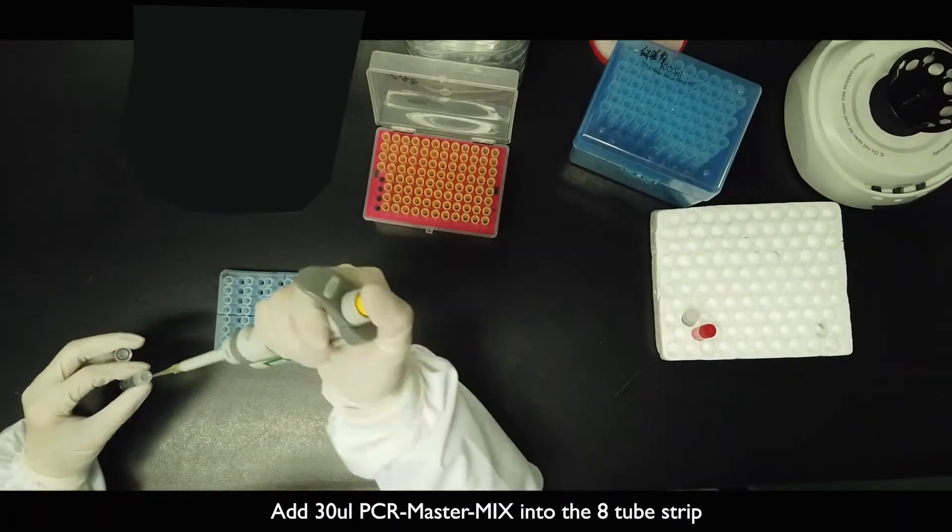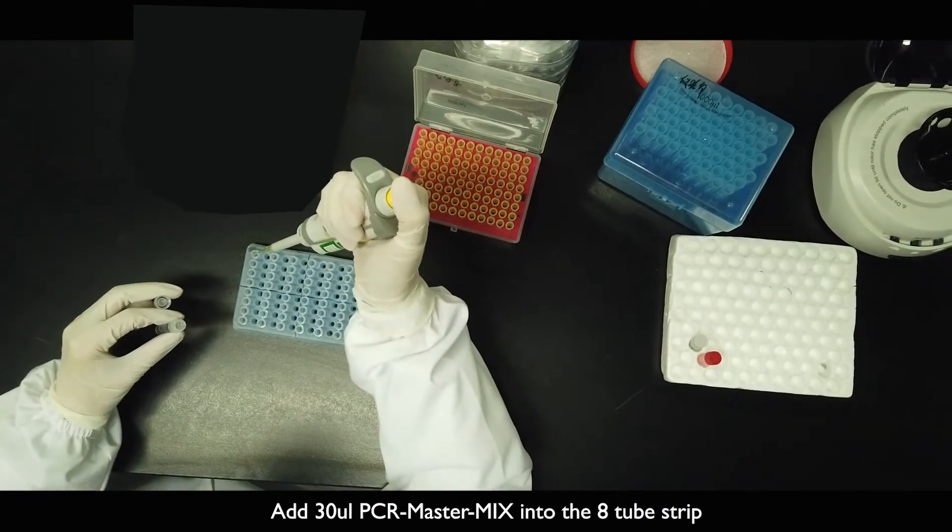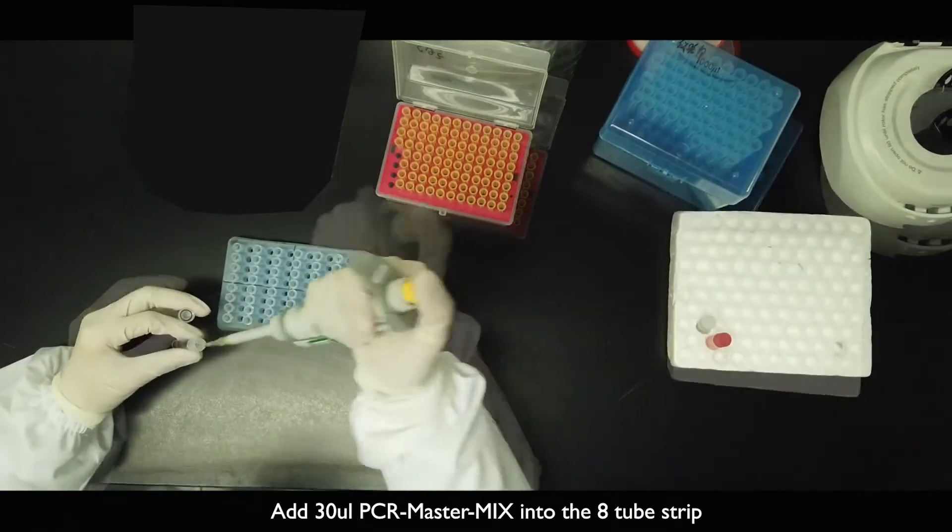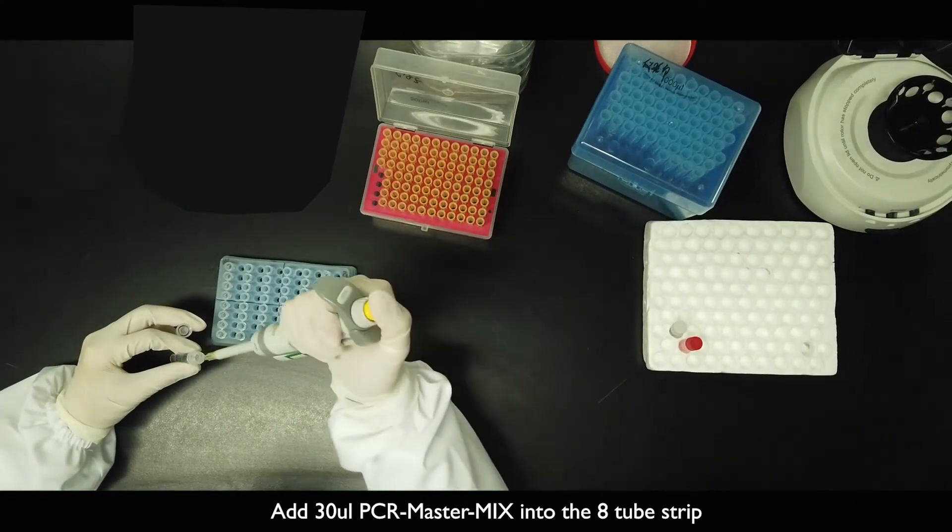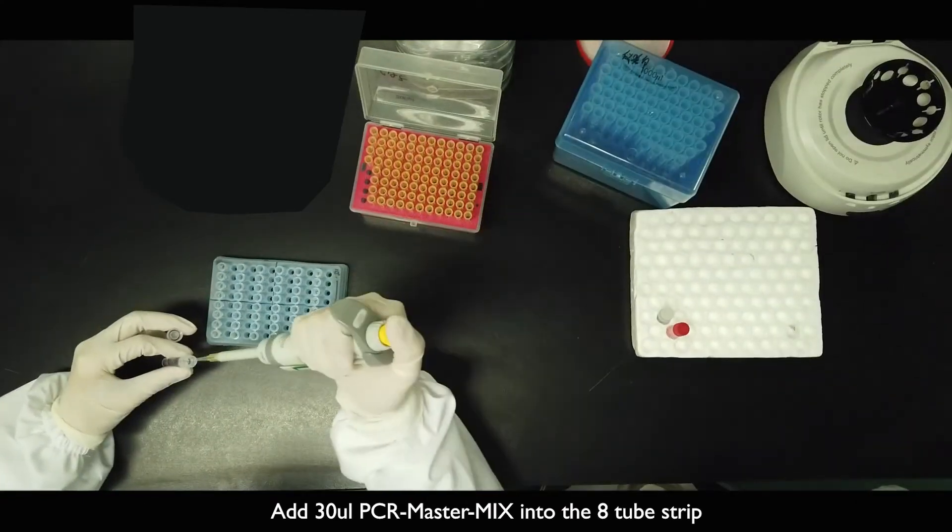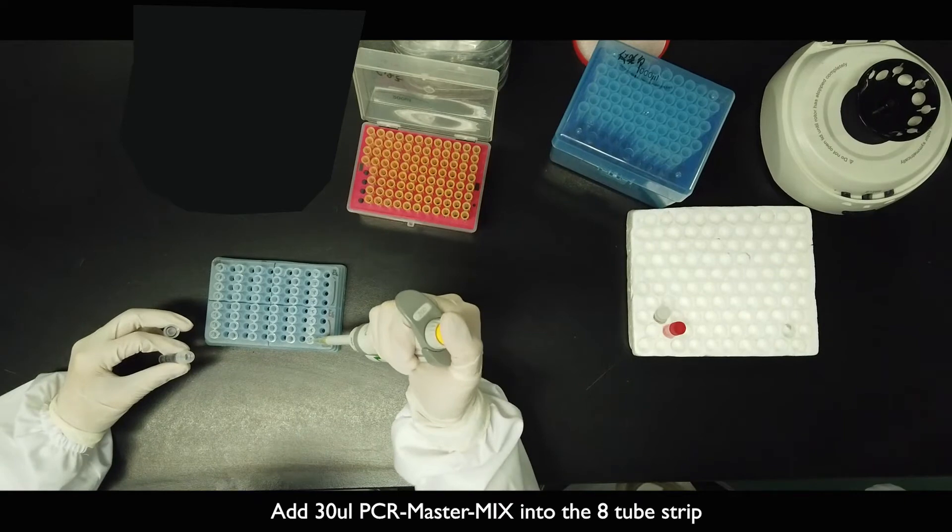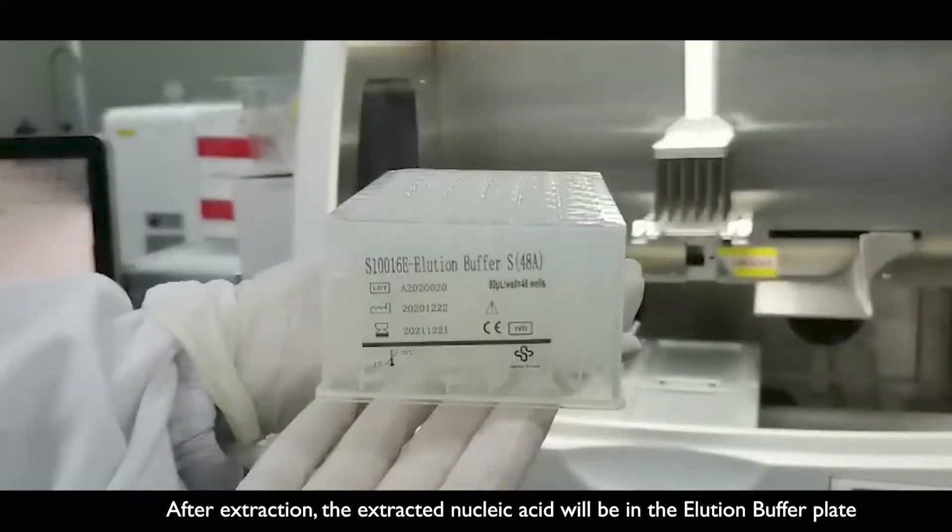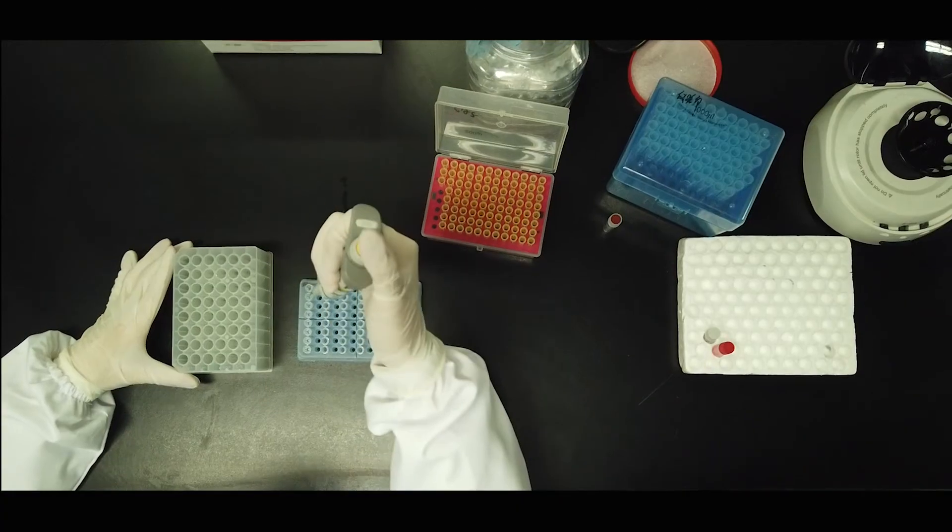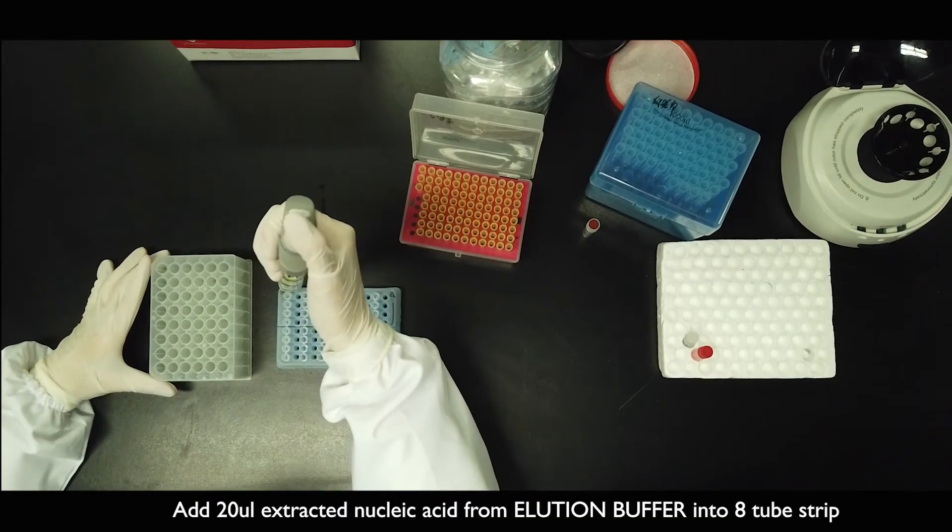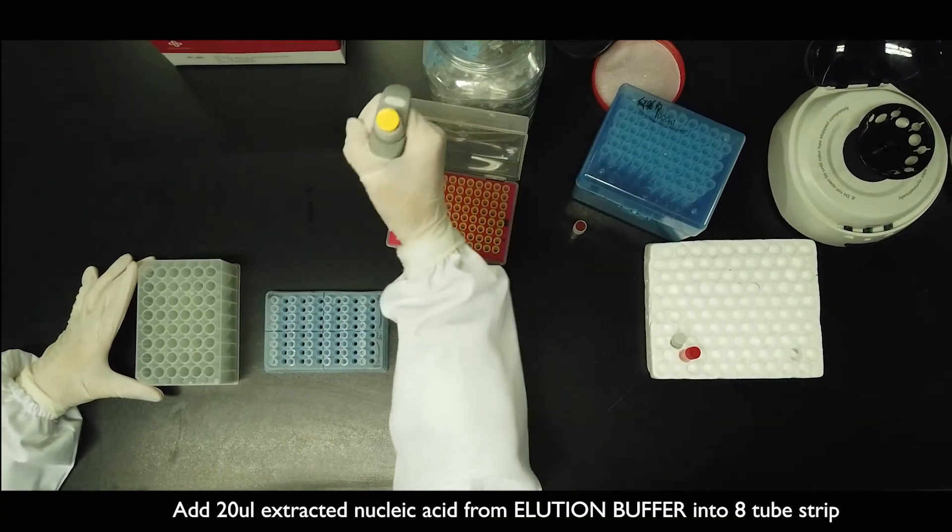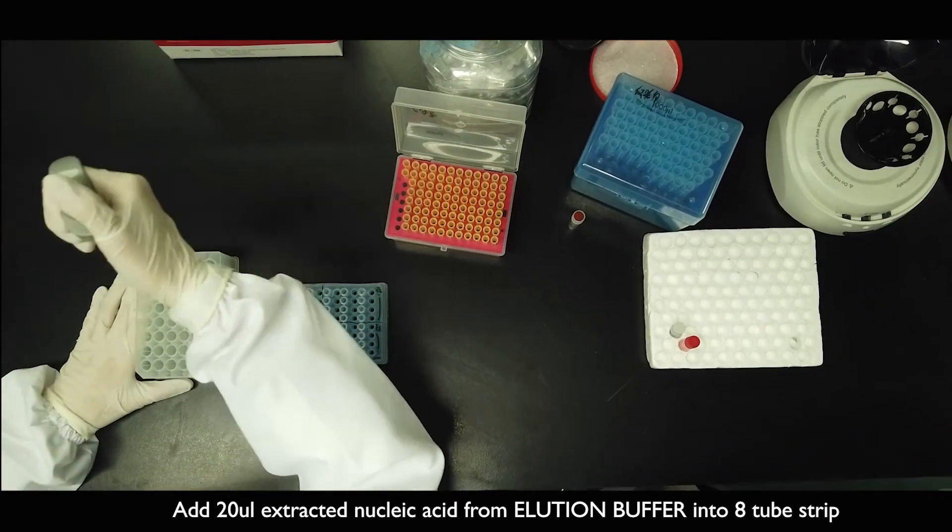Add 30 µL PCR master mix into the 8 tube strip. After extraction, the extracted nucleic acid will be in the elution buffer plate. Add 20 µL extracted nucleic acid from elution buffer into the 8 tube strip.